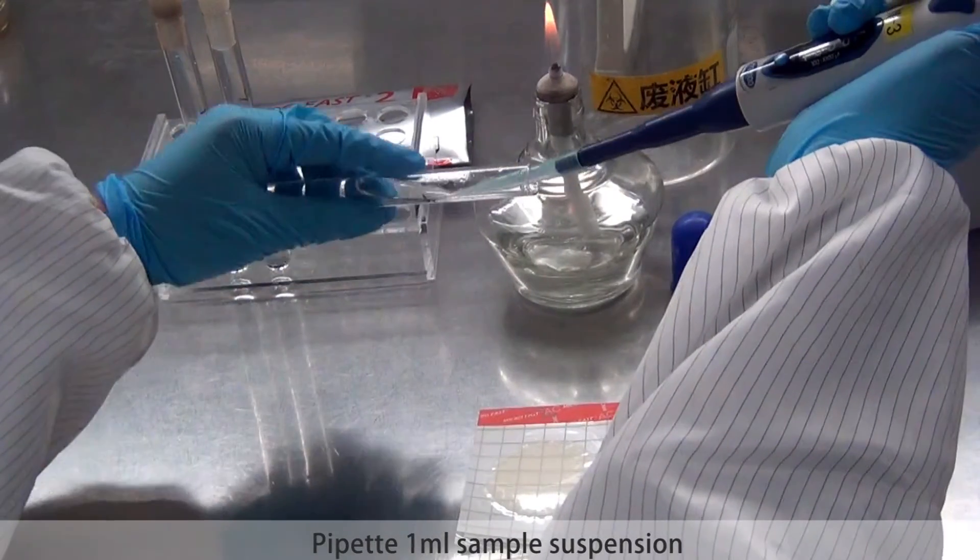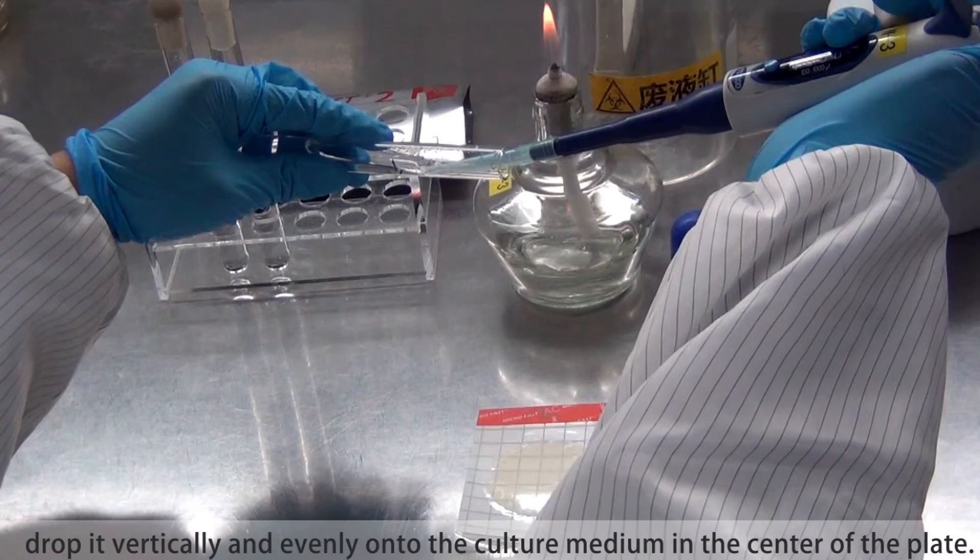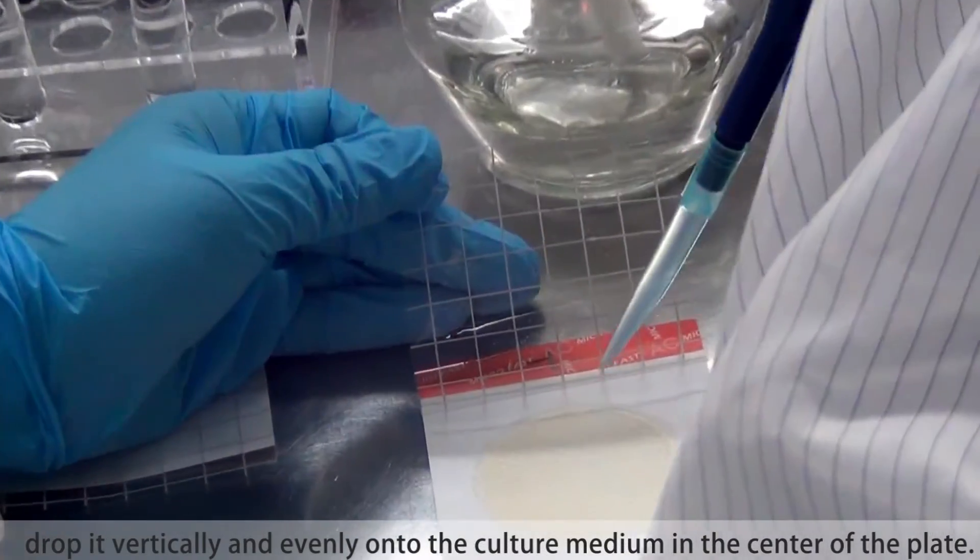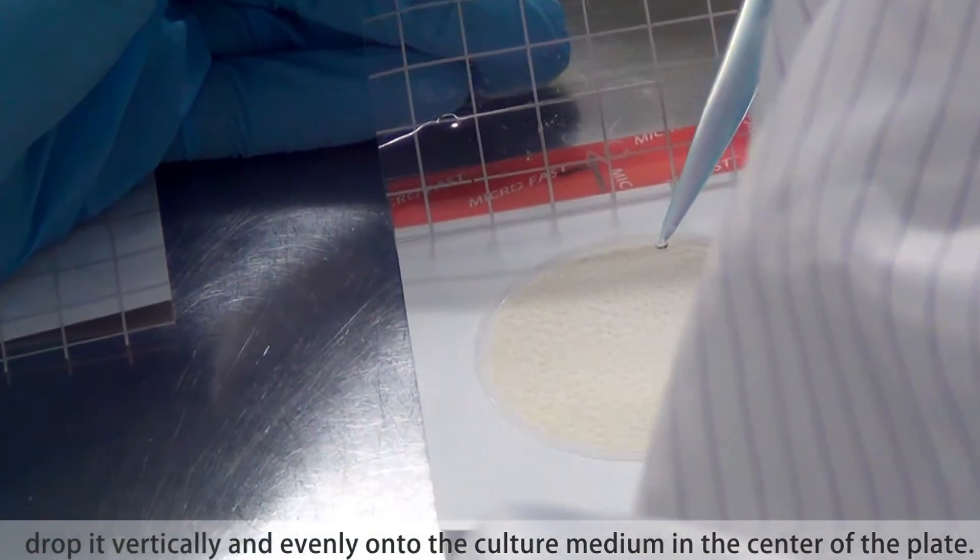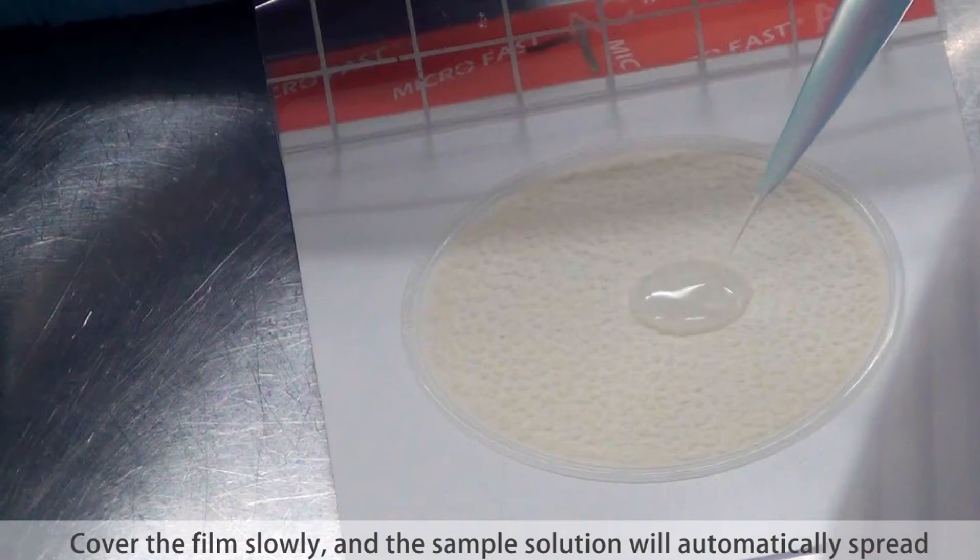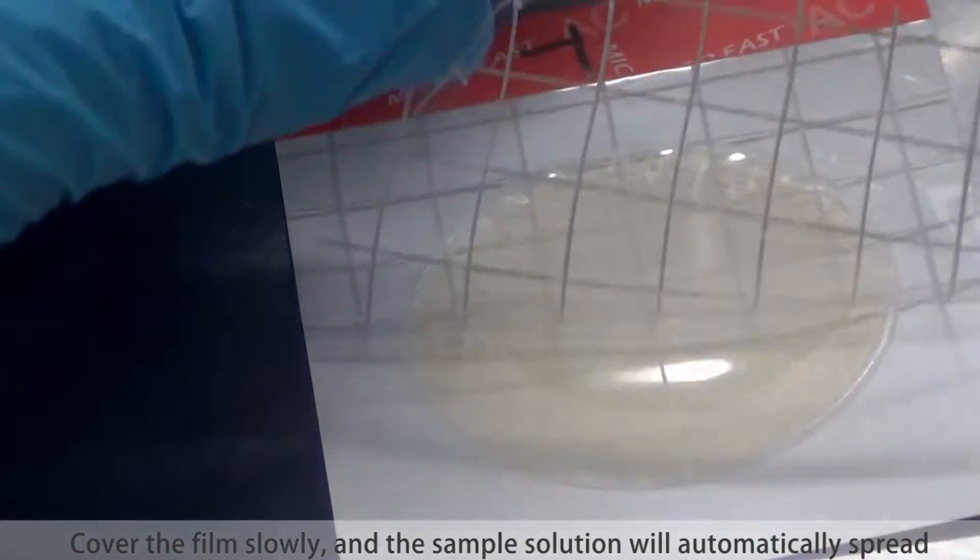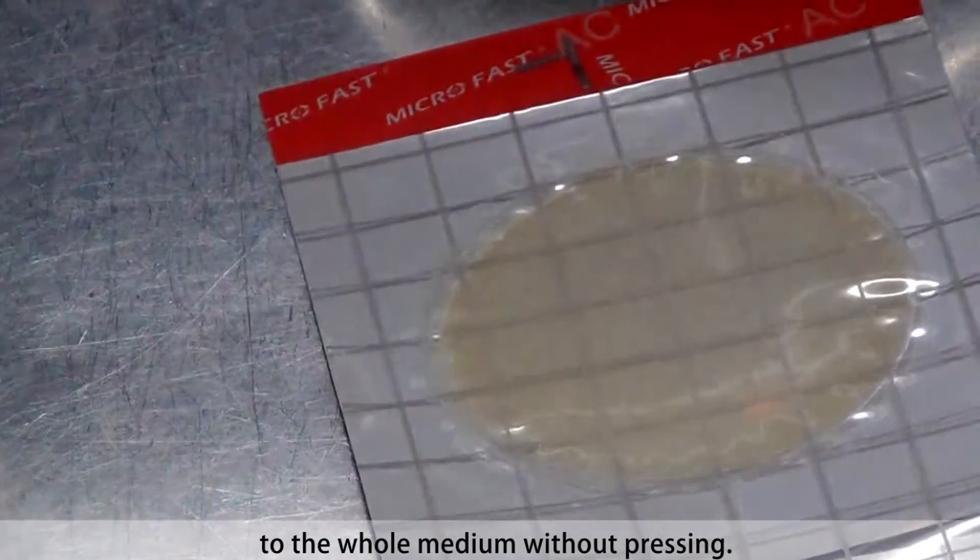Pipette 1 ml sample suspension. Drop it vertically onto the culture medium in the center of the plate. Cover the film slowly and the sample solution will automatically spread to the whole medium without pressing.